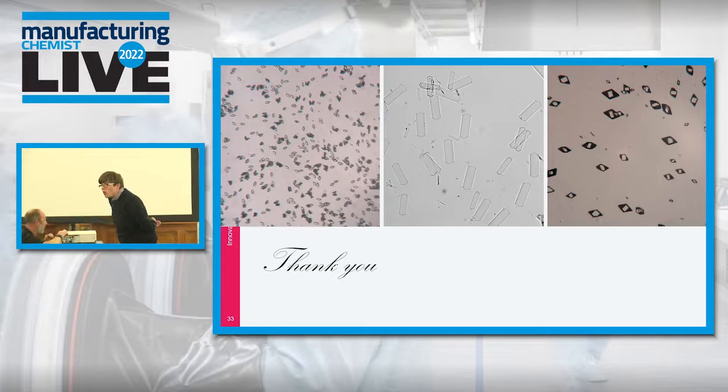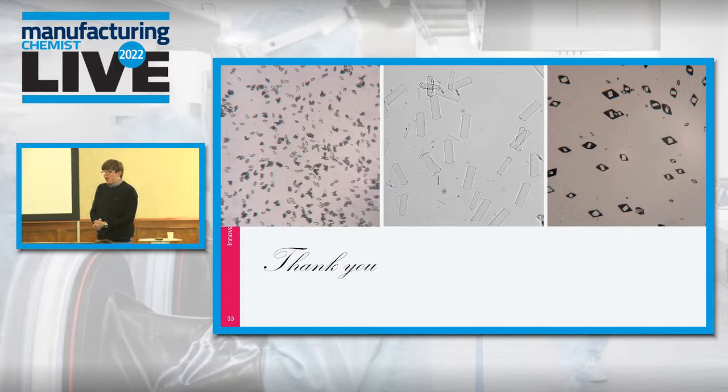That depends, really, on how R&D and how commercial it is. When we work with customers, they may give us a formulation where they're very rigid and say, you have to use this, you have to make this work. And if that's the case, then we have to do some tinkering, either with the API concentration or with temperature, and so forth. The main thing to look at is solubility, making sure your API is as soluble in the solvent and as insoluble in the anti-solvent as possible, and that the liquids are miscible. Those are the main parameters. Brilliant, thank you.